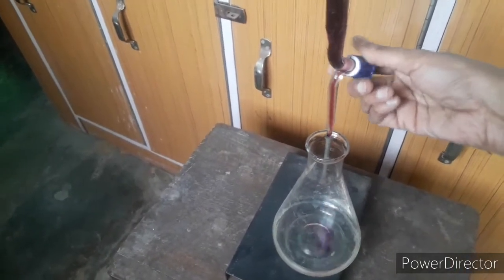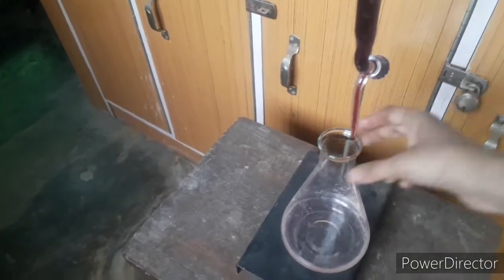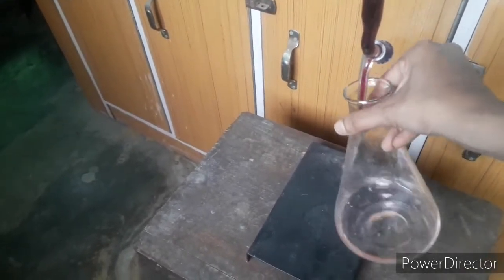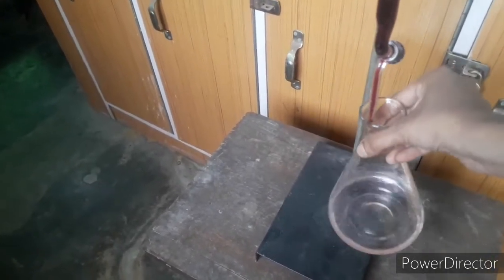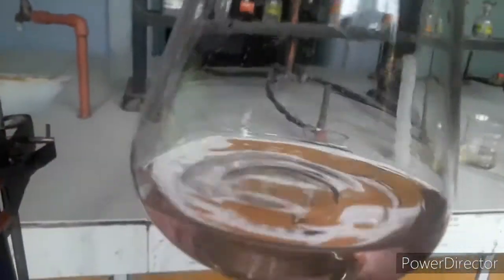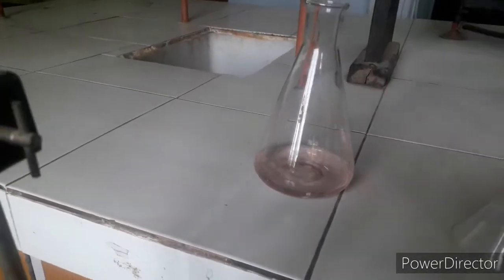Add a few more drops — you can see the pink color has appeared. At that point, close the knob immediately. The pink color is now retained in the flask — that is your endpoint. Hold the flask up in the light to clearly see the light pink color. Place it on a white platform so the color is more visible. This is your endpoint and your titre value.